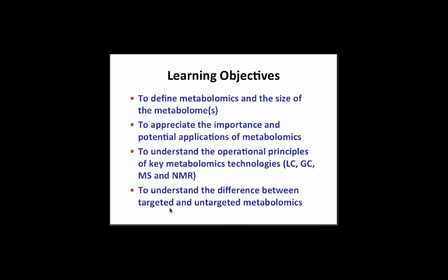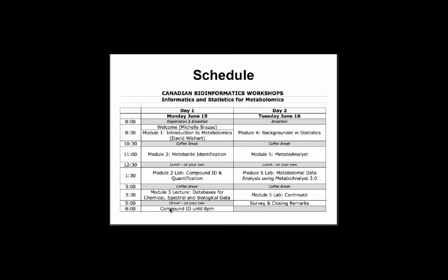Now, some of you are already using these instruments. Some of you are familiar with one, but not the other. Some of you are more of a computational background, and so this will be new to you. Others are probably far more familiar with these technologies than I am. So again, we'll probably see a range. If you have some things you'd like to add or feel that we're missing something, let us know, because it's a small group, and we could all share in that kind of expertise. And then we're going to talk a little bit about the differences between targeted and untargeted metabolomics, which I think is an important distinction. Michelle's already given you the schedule, and we'll try and follow that fairly closely. I think we're so far right on track.